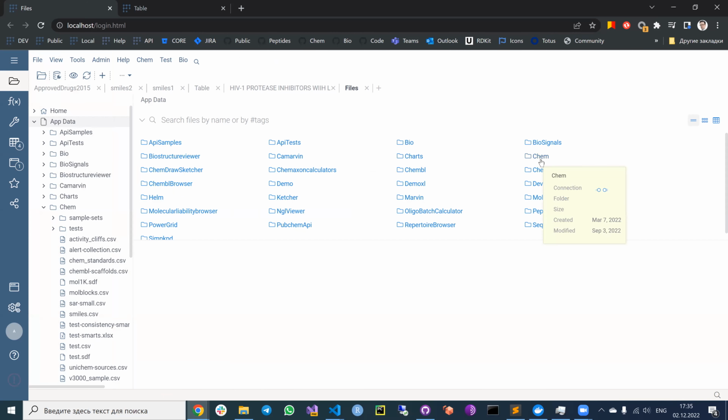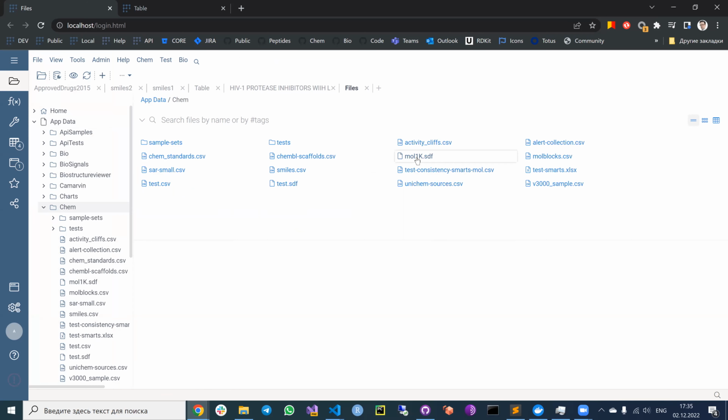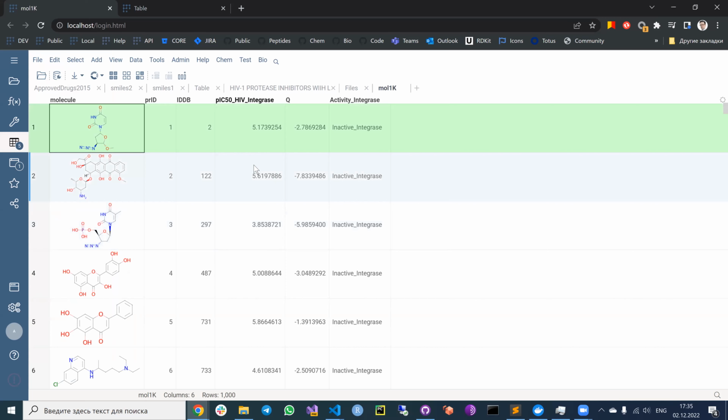That's a very important question. Just for now, it is checked if all the tags, but by tags you mean properties in the SDF file, right? Yeah. Sometimes they call them tags, sometimes they call them properties. It's basically the things that start with the greater than sign, and then the name, and then the value underneath.